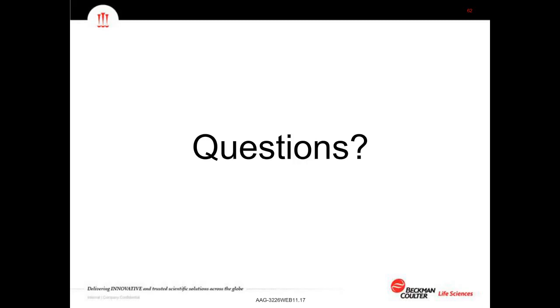I currently culture T75 flasks. Can I use this on one of your systems? And if not, then what are the alternatives? Yeah, that's a good question. It's often one of the things that we have to think about most carefully when we move over to automation, that the labware that you use manually is probably not the same as the labware you would use in an automated platform. A T75 flask is not what we'd call a standard footprint labware for an automated system.